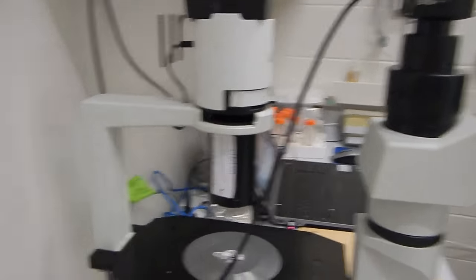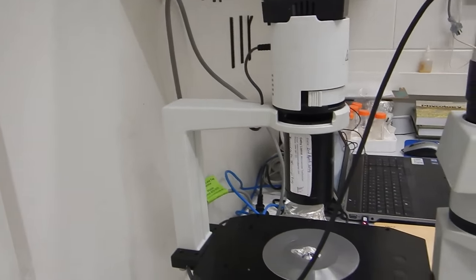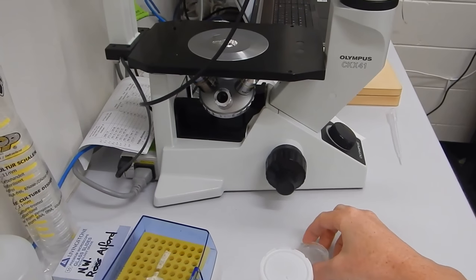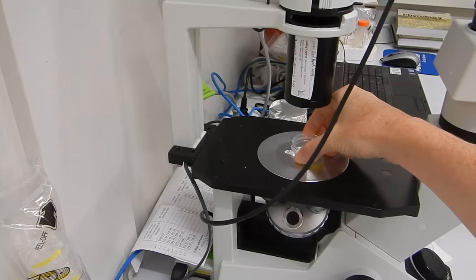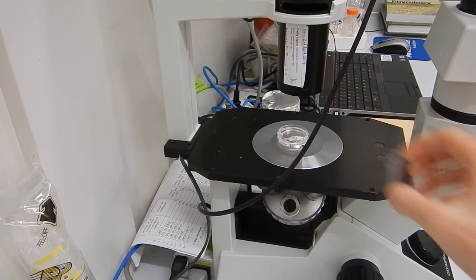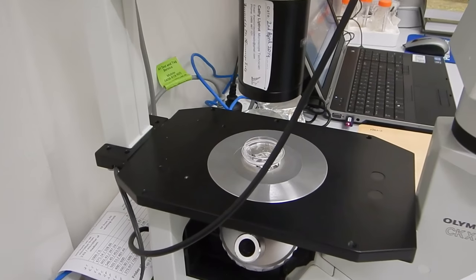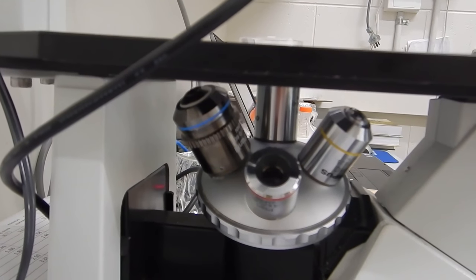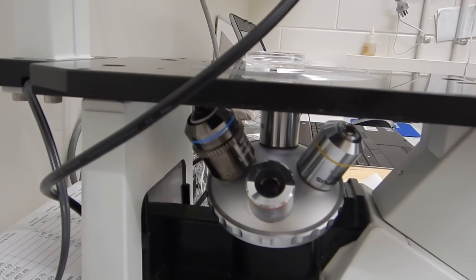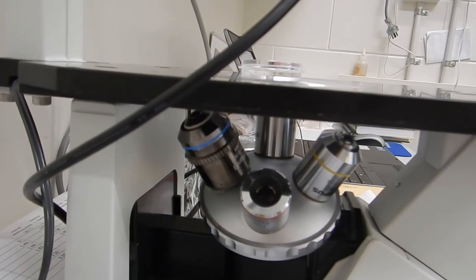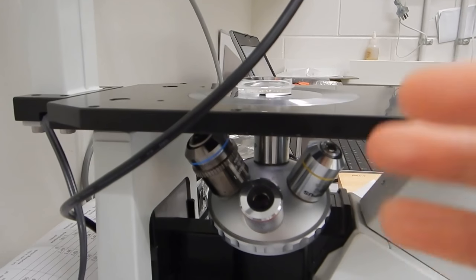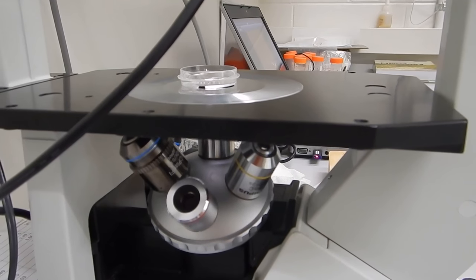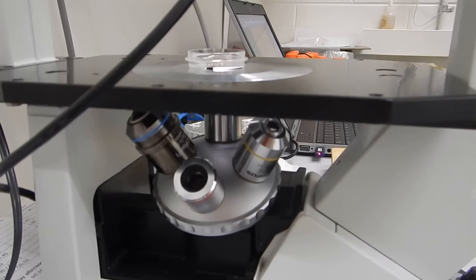The beauty of this is that you can take a living specimen, which I'm going to do, and place it here. This way your lenses don't run the risk of getting wet and touching the water sample on top, but they can get very close. Also, many microorganisms settle to the bottom of the dish, so the lenses get very close to them and you get a very good view.